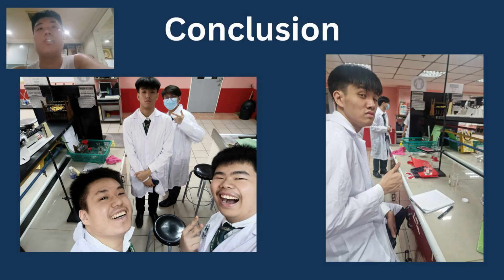Conclusion and recommendation. Overall, the experiment is a success, as it shows that as time progresses within the reaction, the R value representing the product increases, while the concentration of the blue dye reactant decreases due to the inverse relationship between absorption value and R value.